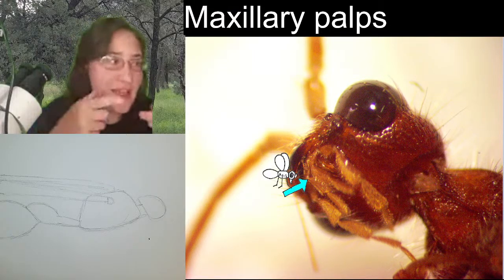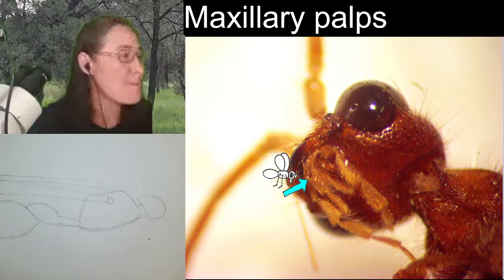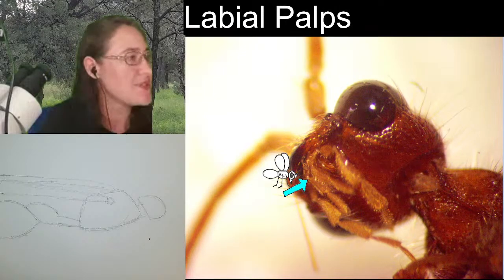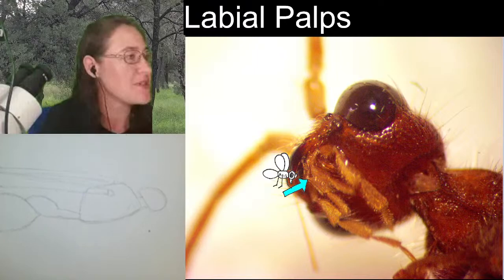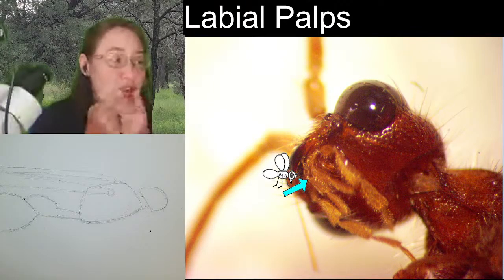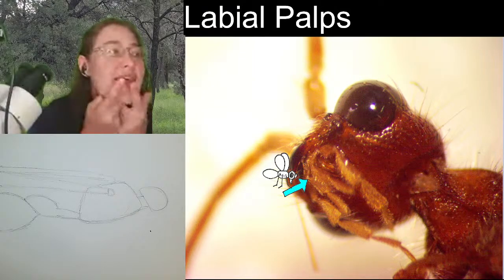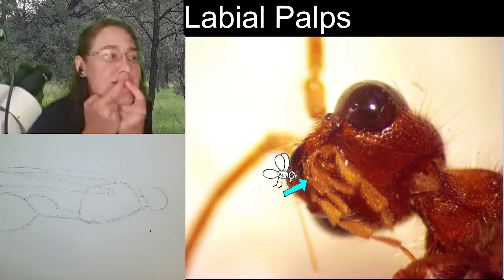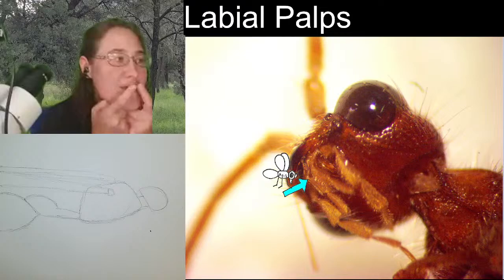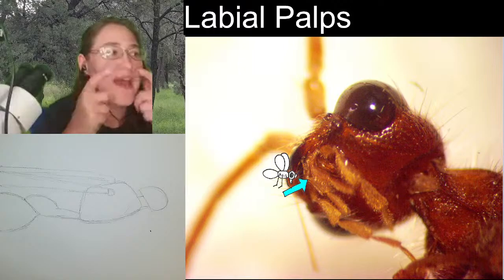And then the other set of palps that it has are called labial palps. Labial palps exist under the maxillary palps, and they're connected to the labium, which is the bottom jaw of the insect. Generally they're shorter, and they kind of face up like this, and they make this movement here. So you've got the maxillary palps up here that push in this way, and then the labial palps that push in this way.